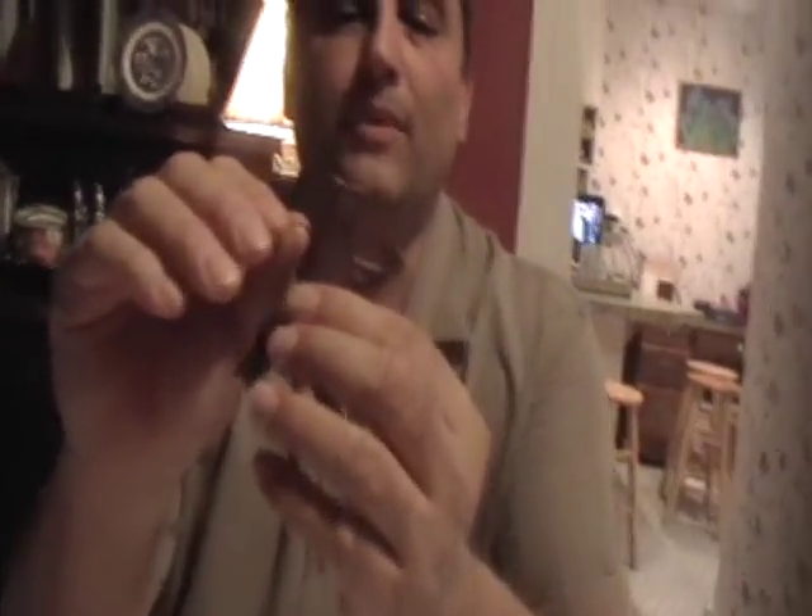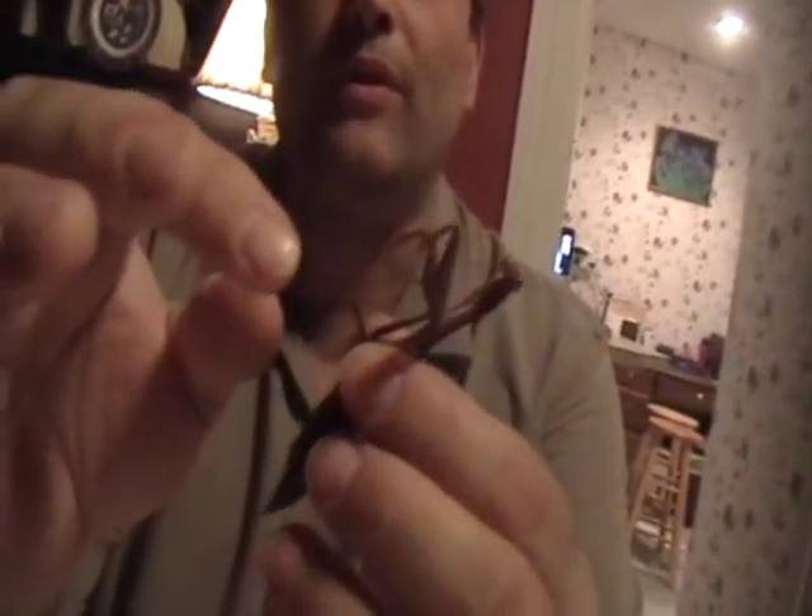Hi, I'm Paul Napsker with InsectsForSale.com and I wanted to demonstrate to you how to use appendage relaxing fluid. A lot of people order insects from me and the insects are dried, or sometimes you may capture insects, kill them, and they dry out. And then it becomes a dilemma to be able to pin them because they're very brittle. Here is a praying mantis who's extremely brittle.